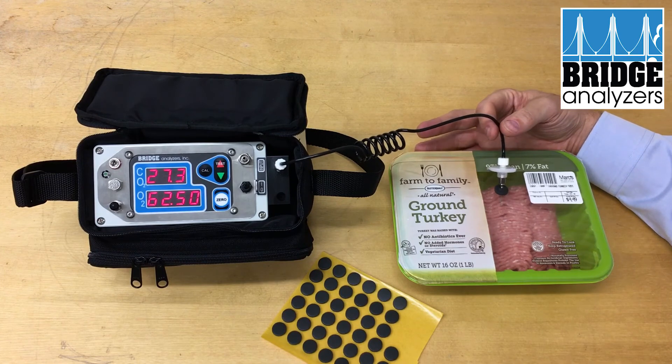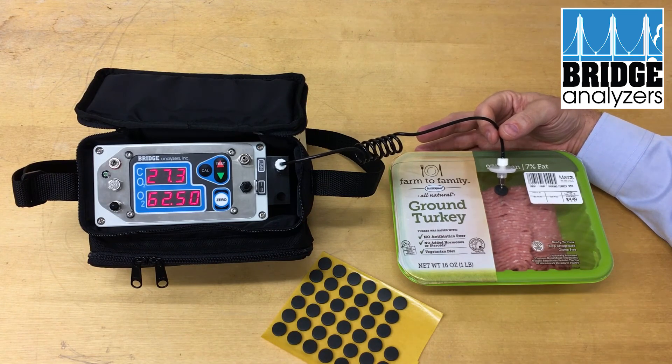In this particular case, the CO2 level is 27 percent and the oxygen level is 62 percent. So this was clearly packaged in a high-ox gas and looks to be good.